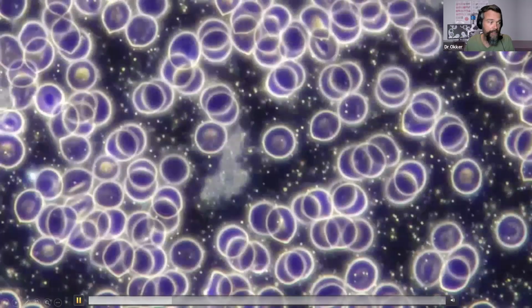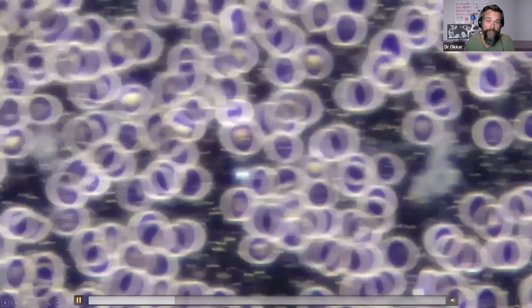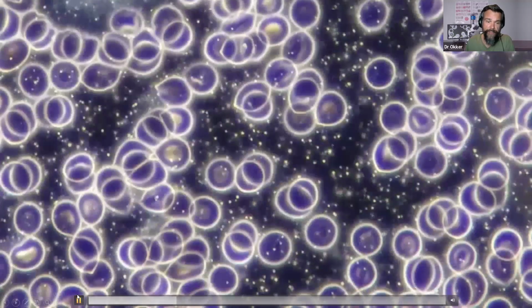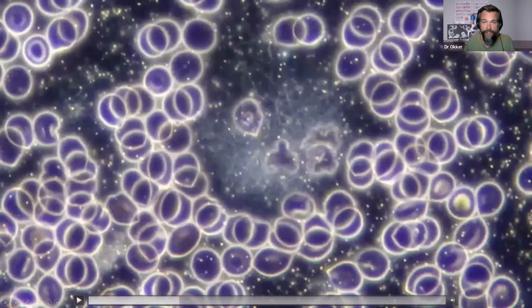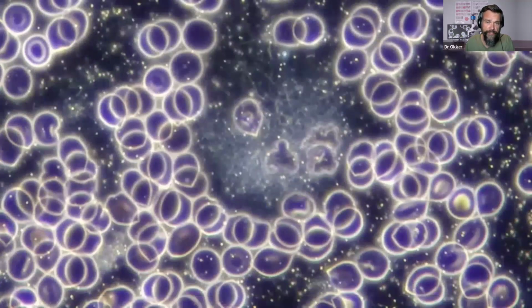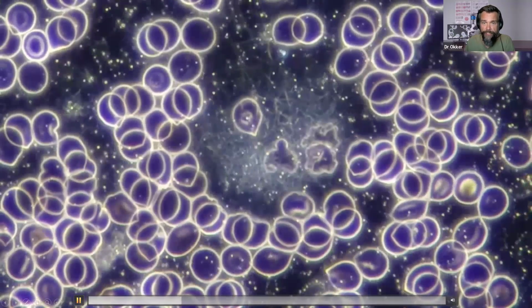We can actually see the lobes of the nucleus and the movement of the granules within the white blood cell cytoplasm. So also a very interesting finding there in the center of the screen. We're seeing all these white lines. That's fibrin. It's an indication of liver stress. And we tend to see this quite early, before there's actual damage to the liver cells. We see stress affecting the liver, and usually that can be easily addressed with the correct nutritional supplementation and dietary changes.